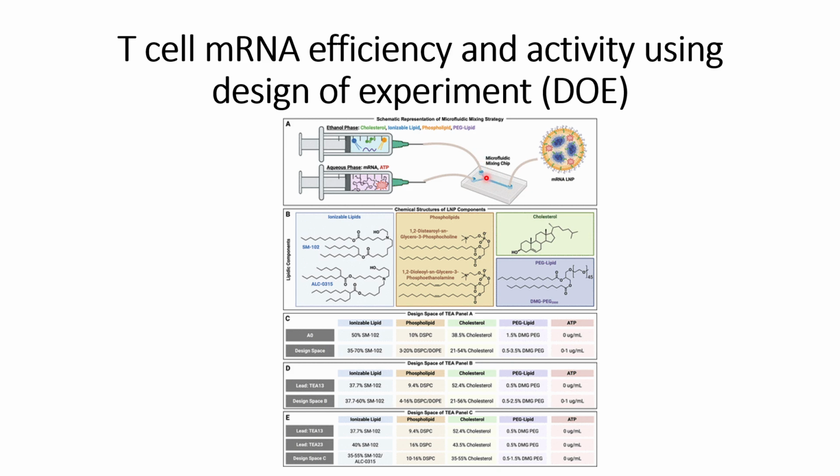In both cases, what they found is that the microfluidic mixing chip results in better transfection and translation of the mRNA. In order to validate their lipid nanoparticles, the mRNA that they use is Firefly Luciferase, so that they can see the signals when the mRNA is translated.